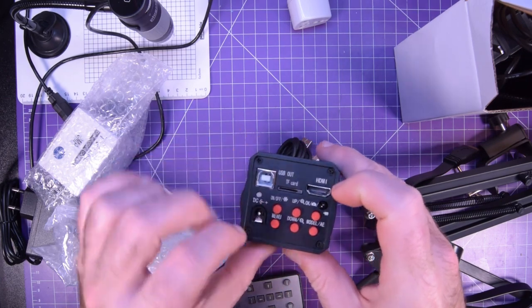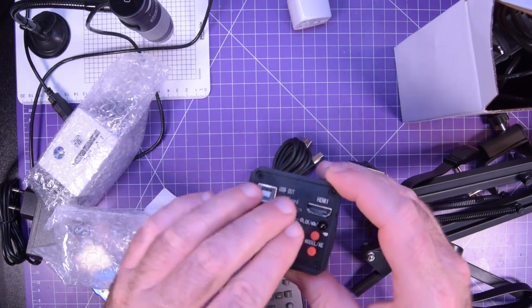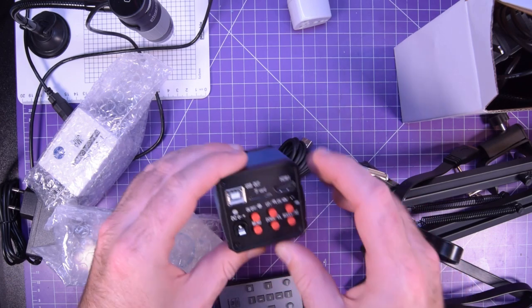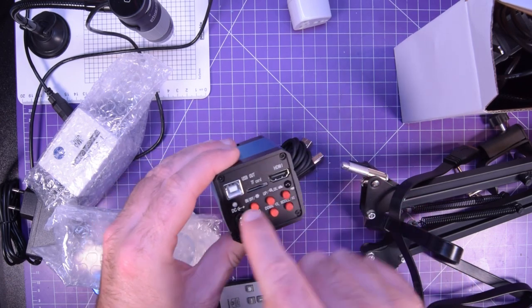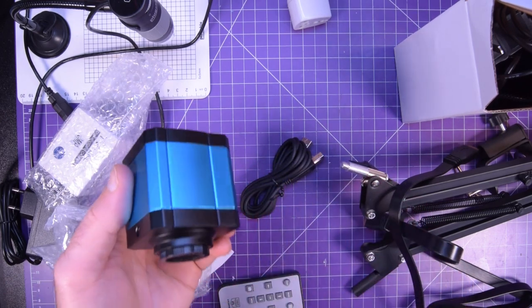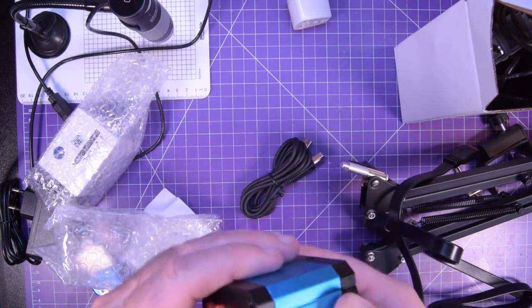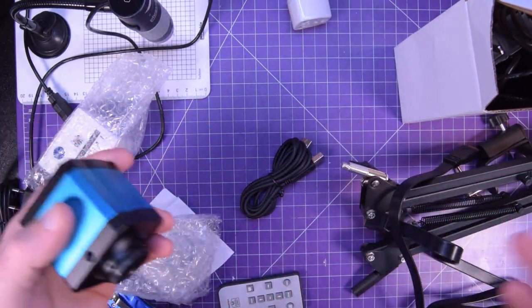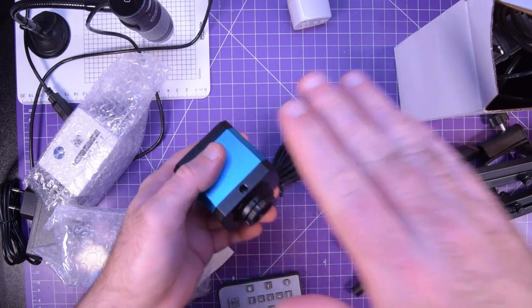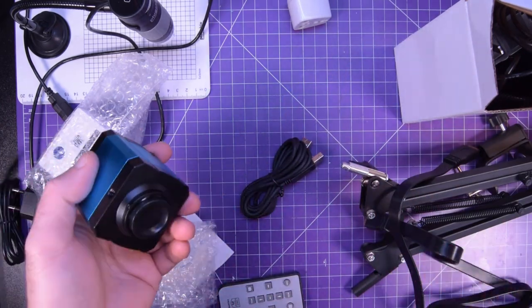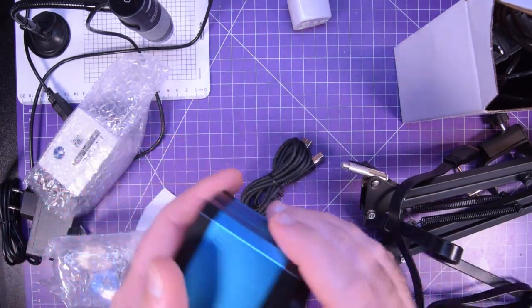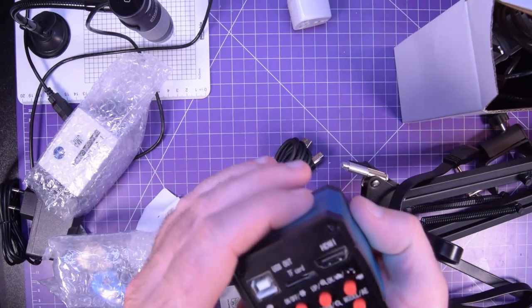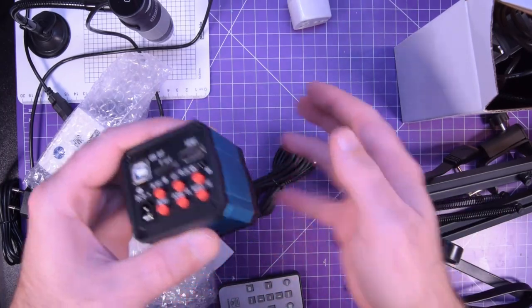Yeah, HDMI, USB. There's the DC barrel jack. A little bit of a menu thing. Infrared receiver, TF card. So, what I wanted this thing for is if it makes a competent microscope with a lot of range, which I'm hoping, then it's going to be a great microscope to solder under. Because you need to get under there.